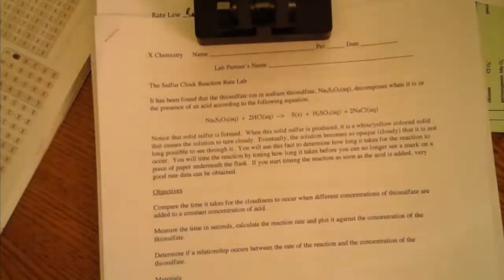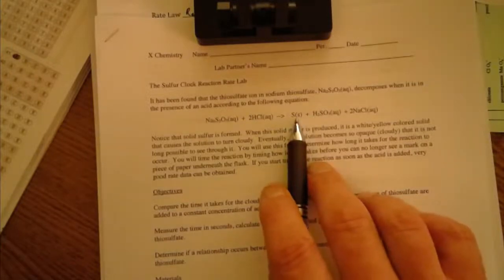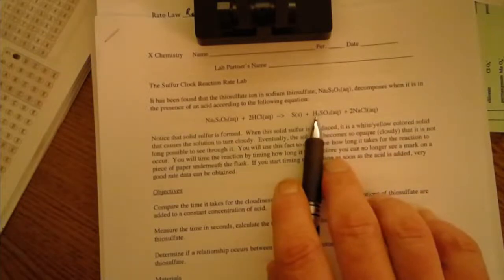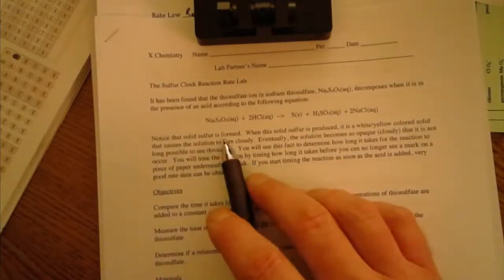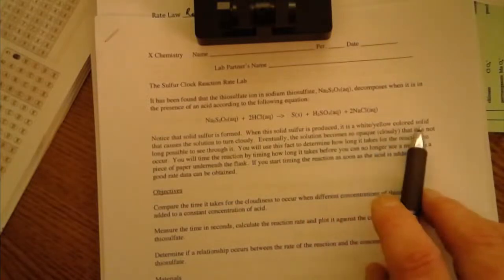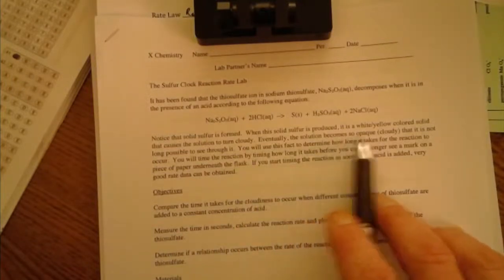will be dissolved. It will then basically react to give you sulfur, which is a solid, and the other two are aqueous. Notice this acid with the H here, that is sulfurous acid. So what we care about is that solid sulfur is formed. When the solid sulfur is produced, it is white or yellow. You'll see yellow probably. That causes the solution to turn cloudy. Eventually the solution will become opaque.